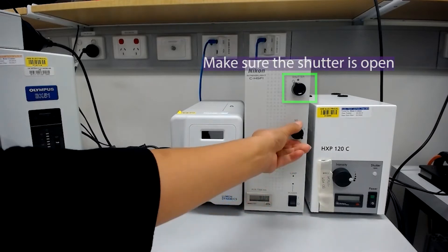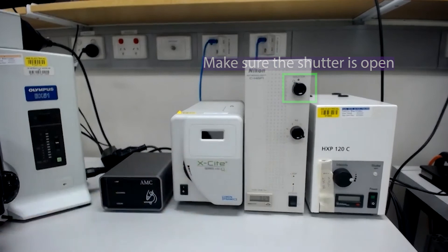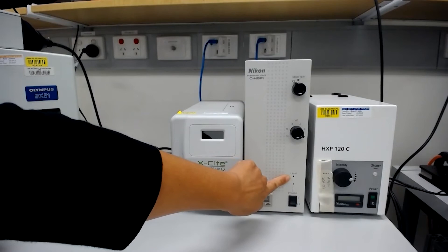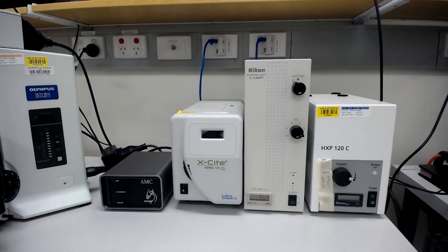The intensity of the Intensilite can be controlled by changing the neutral density filter at the front. However, sometimes this lamp doesn't start up, so make sure the lamp indicator at the front stops flashing and changes to solidly on. If it is flashing for more than one minute, turn off the lamp as it can damage the lightbulb. Wait a minute and then try to turn the lamp on again.